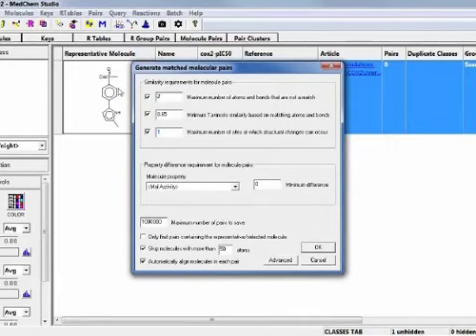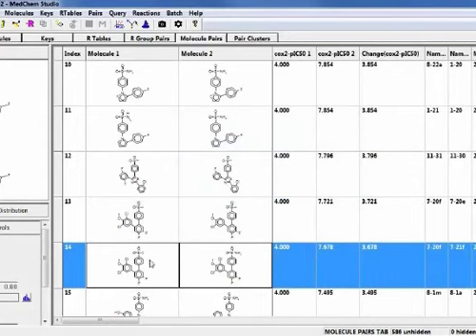So we do a reaction query, and I've already stored this on disk, but what it is is a SMIRKS string that says, okay, find molecules where you have this methyl sulfone that's being converted into a sulfonamide. So I click OK. That selects 95 of these rows, and as you can see, these now have the desired transformation that we want to see.